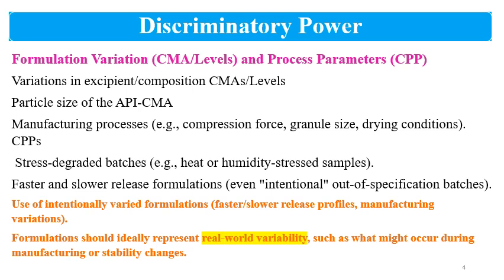So always understand that all the modified release types of formulations should be developed with the aim that you have a discriminatory dissolution method.